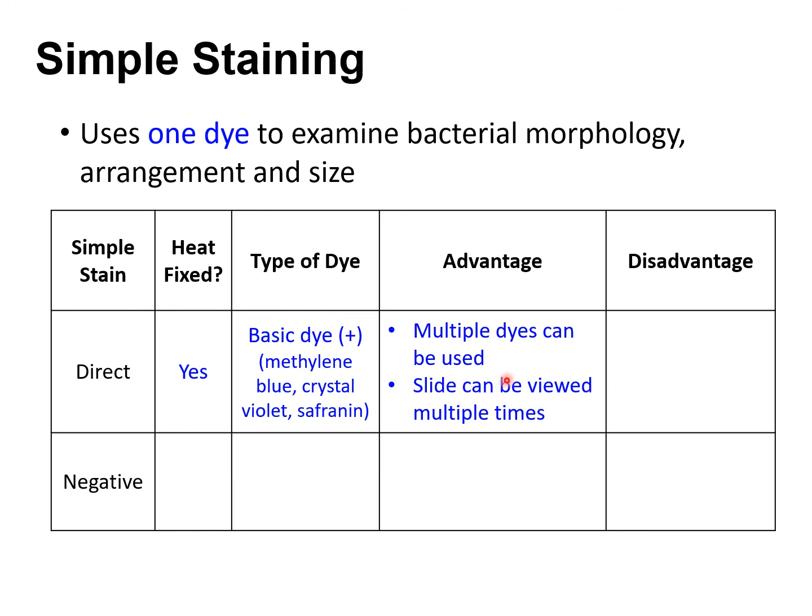There are lots of basic stains out there. There are multiple dyes that we can use to stain the bacteria. And depending on the basic dye that you use, that's going to determine the color that you're going to see under the microscope, right?